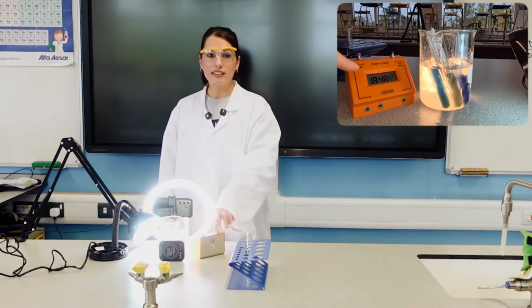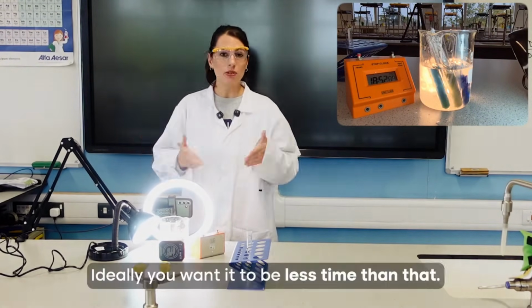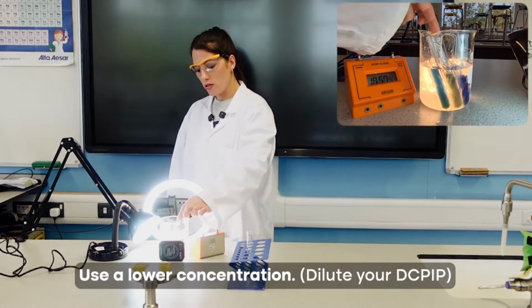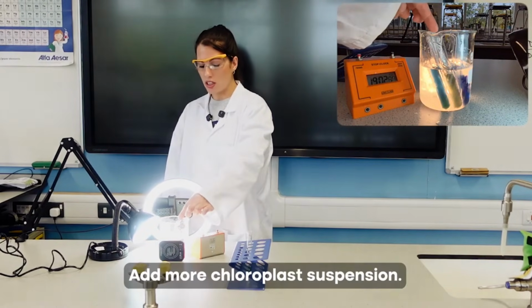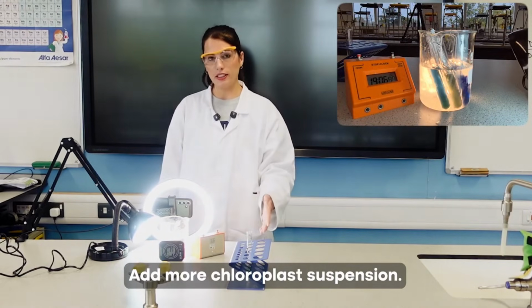So at the moment, we can see that mine's already up to 19 minutes, nearly 20, which for the length of time you have in a lesson, ideally you want to be less than that. So what I'd recommend is you use a lower concentration, so dilute your DCPIP, or you could add more chloroplast suspension, or add a lower volume of the DCPIP.